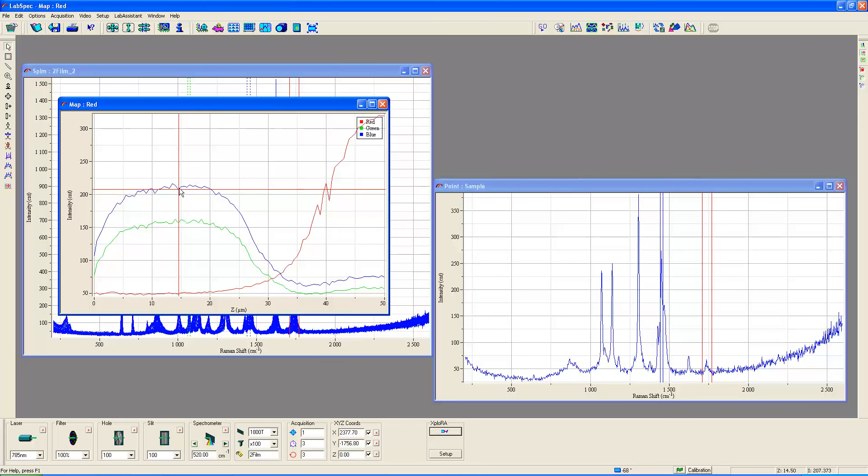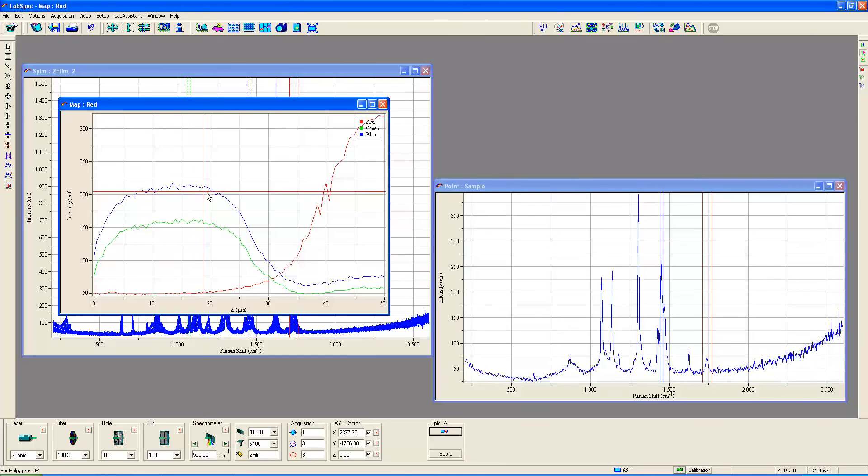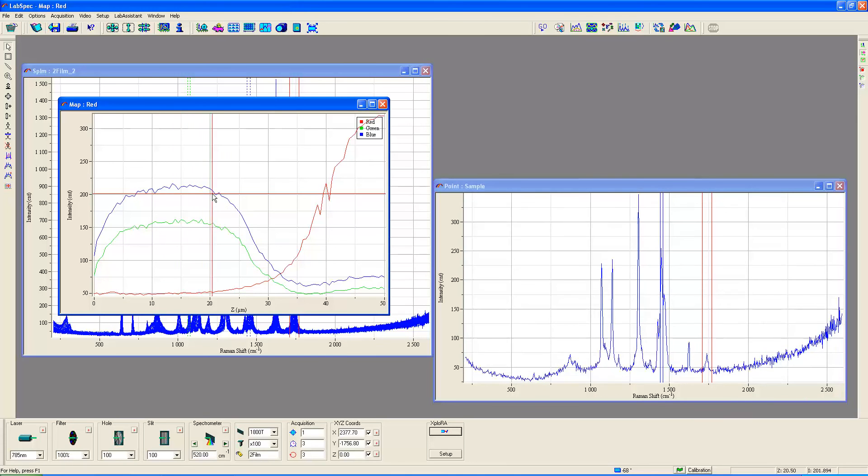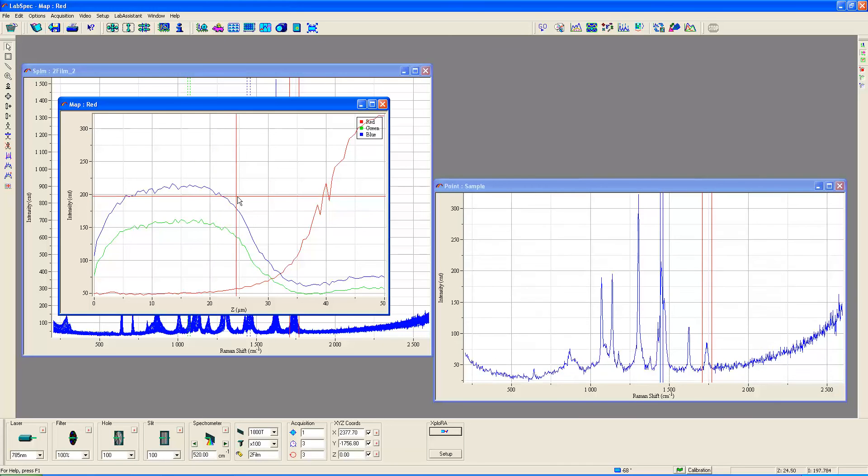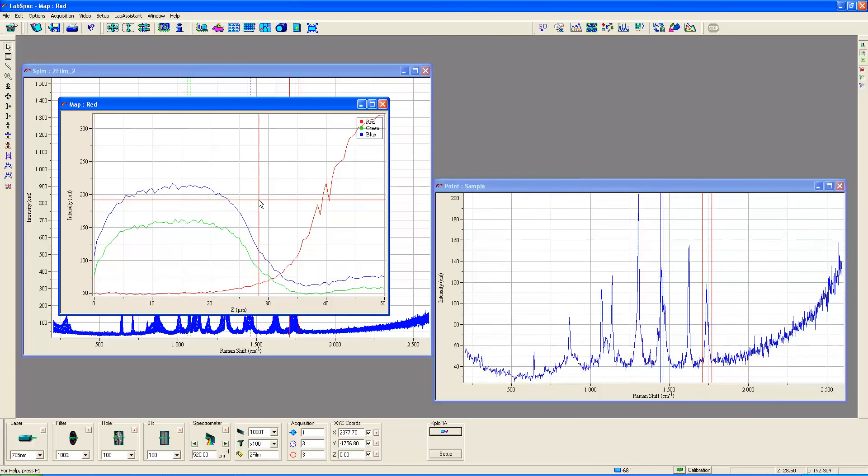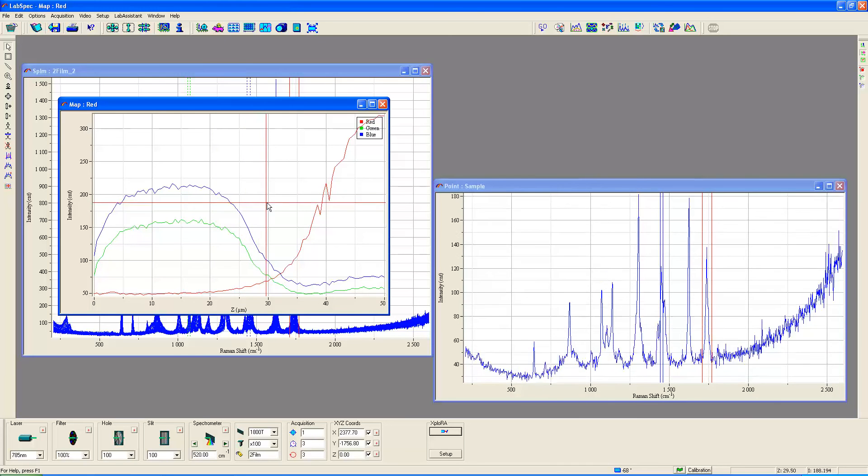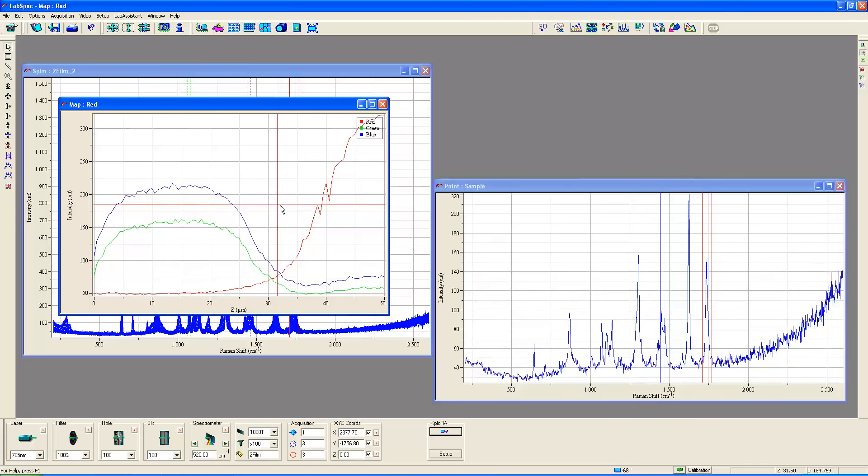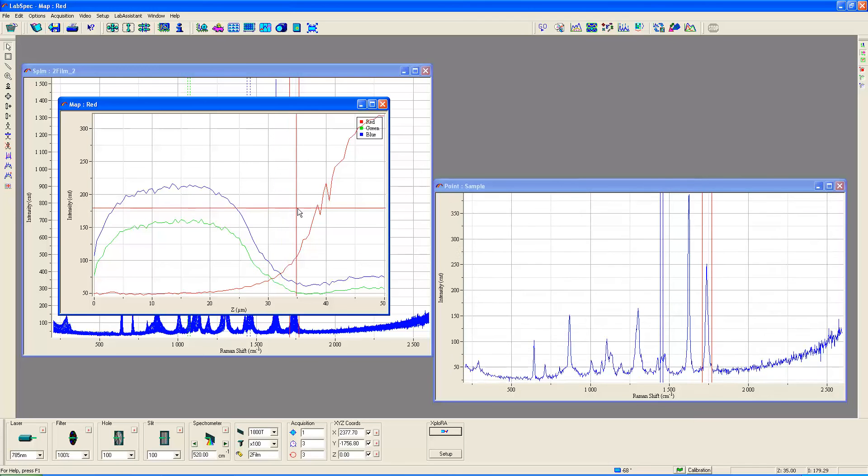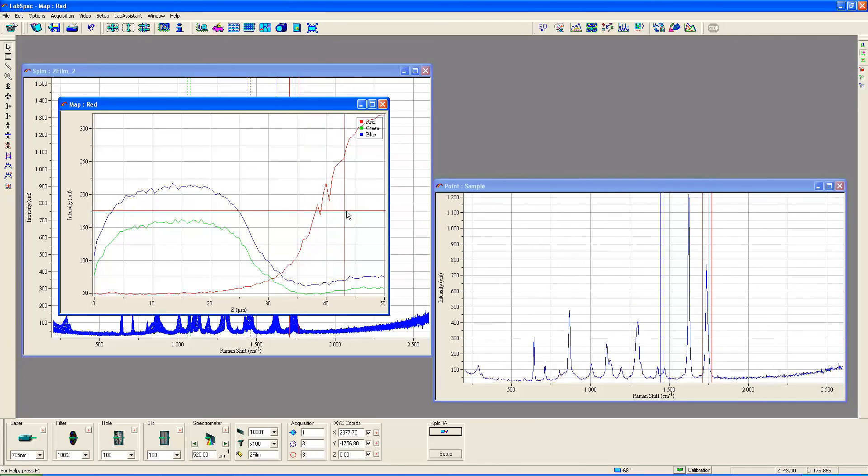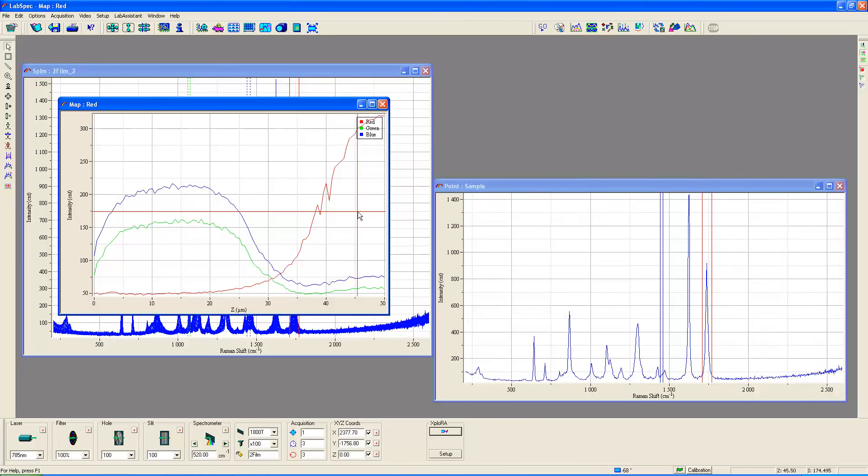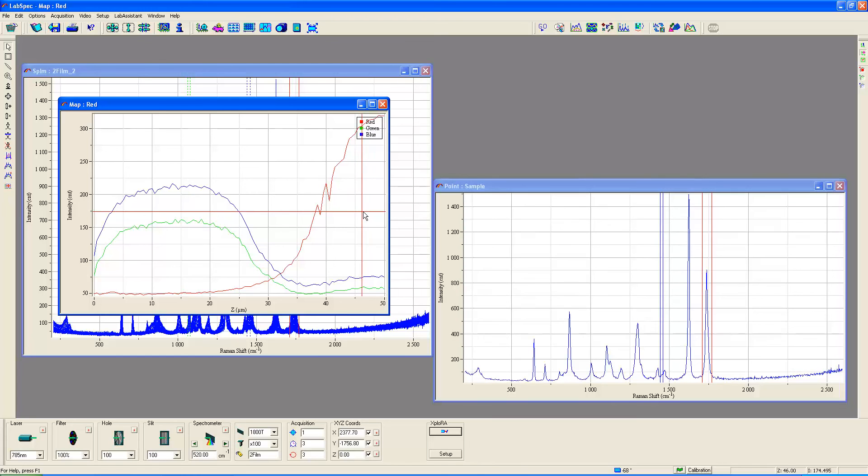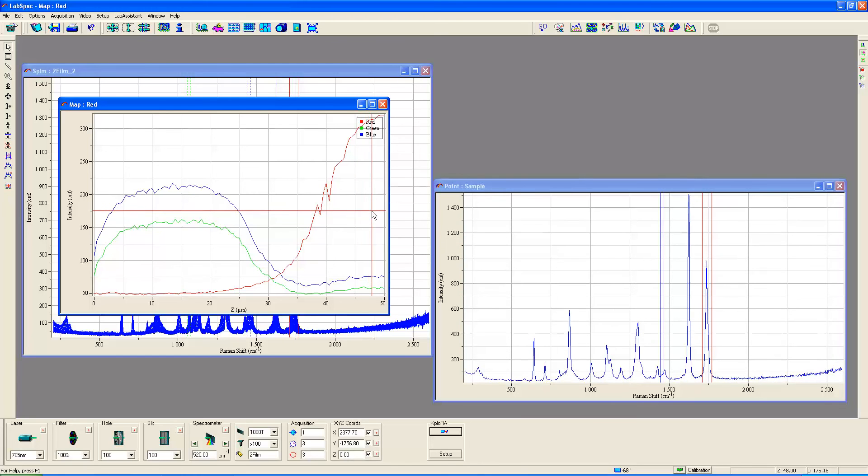As we move through this you're going to want to watch these bands right here as we move through the polyethylene and move deeper and deeper now towards the bottom of the polyethylene. Now you begin to see the polyethylene terephthalate becoming absolutely dominant in the spectrum and the polyethylene essentially vanishes. That's because the polyethylene terephthalate is a much stronger raman scatterer than is the polyethylene.